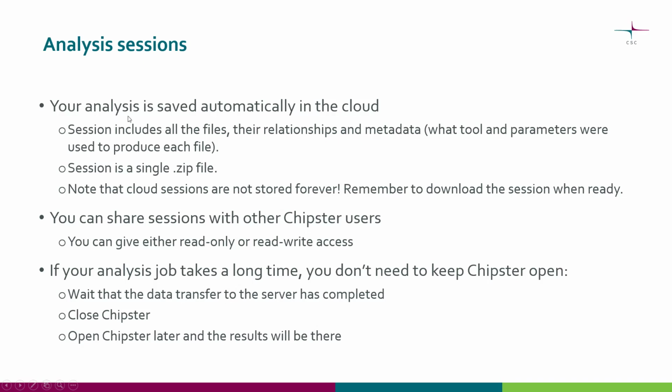When you do your analysis, your results are saved automatically in the cloud. Not only the files are saved, but also information about their relationships and metadata. So what tool and parameters did you use to produce a particular file? It is important to note that Chipster is not a storage place, so these cloud sessions are not stored forever, and we encourage you to download your session to your computer or elsewhere when you are ready with your analysis.